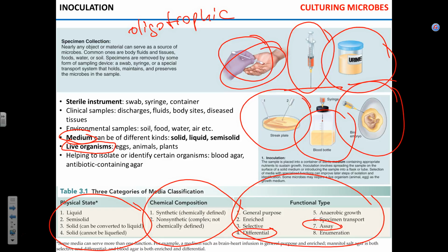When you inoculate this tube, you spread your microbe, your inoculum, through all cells. And the microbe starts to grow in all those cells and causes some chemical changes in those media. Or does not. And when it does cause changes, you can detect this by the color changes, and you end up with a certain code, like a numerical code.